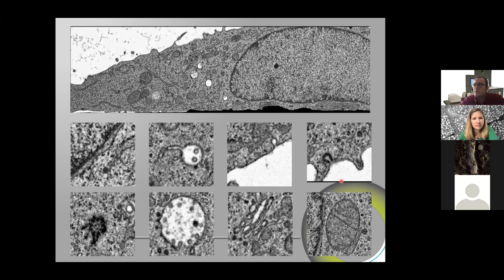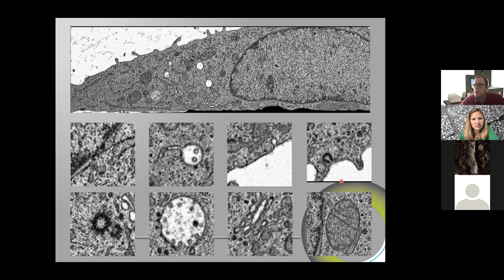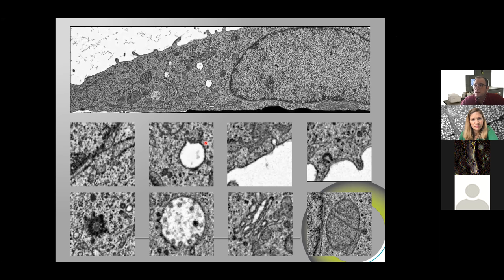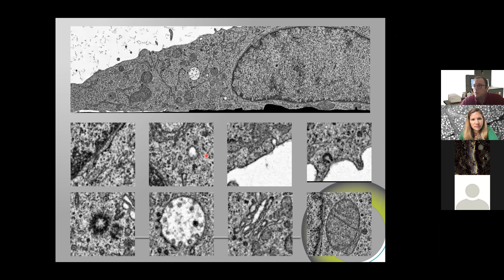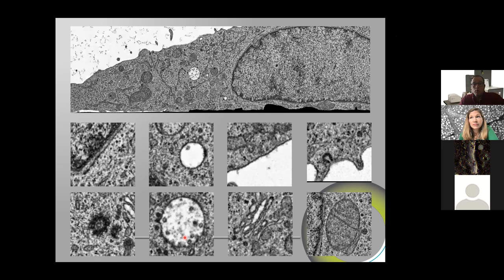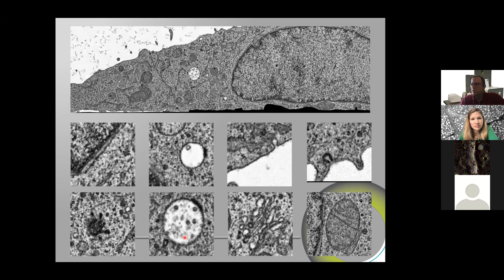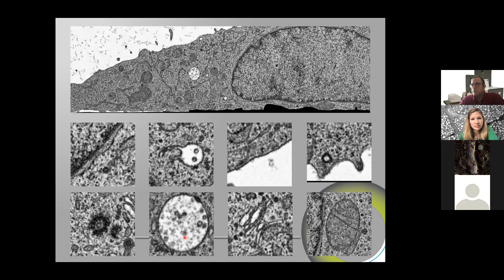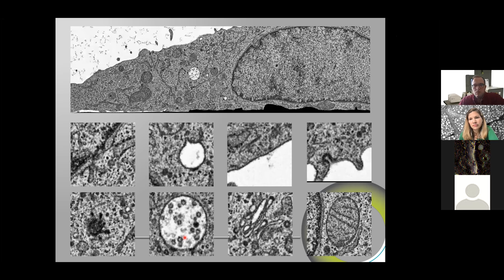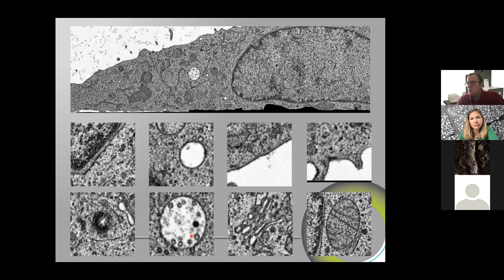We can see that we can find some very detailed structures. Here we have the MTOC, which is nicely resolved next to the Golgi. We see that the endosomes are nicely presented, and we can see even the coat at the membrane of the endosomes. Also here, we see that very well. So we can obtain a very fine resolution, although we have only 0.05% of uranyl acetate in the cocktail and 0.1% or 0.01% of glutaraldehyde. So basically, although we have what we consider as being very close to no contrasting agent, we already have a very high contrast in the structures. And that was surprising to us.